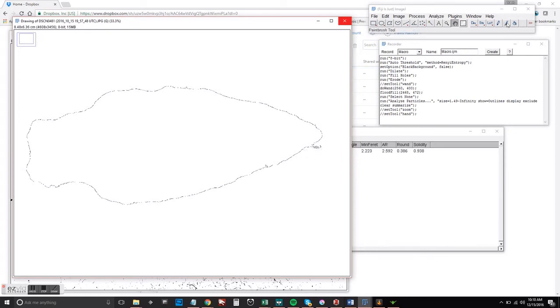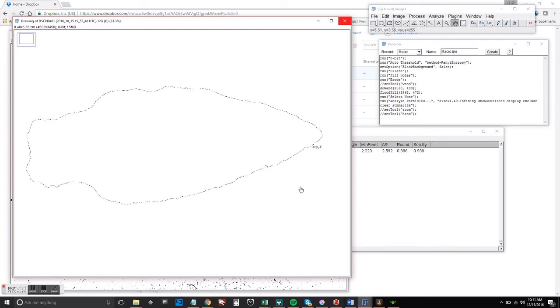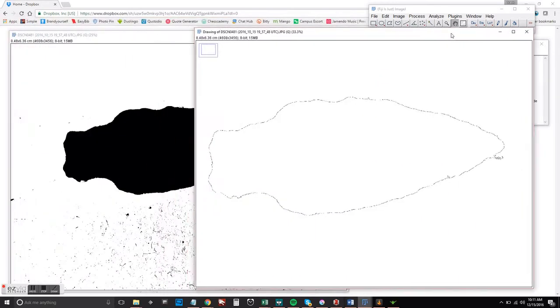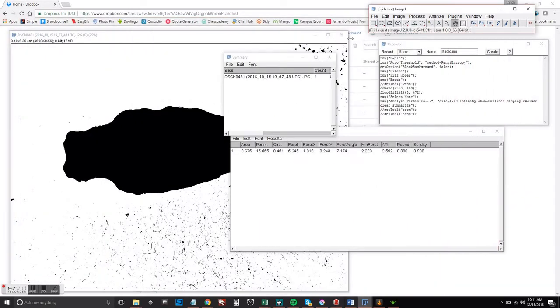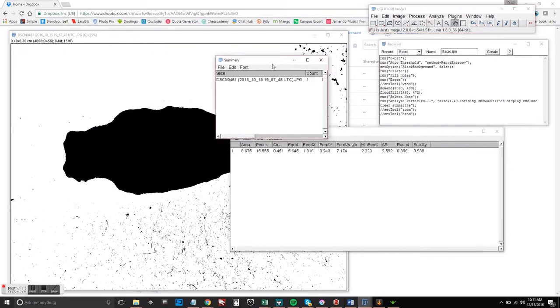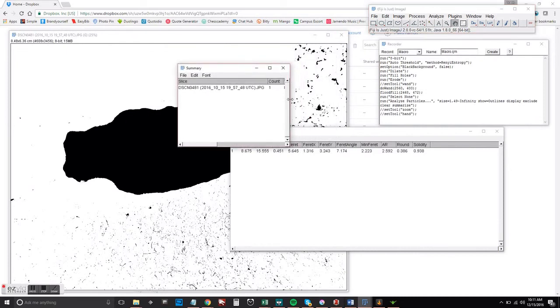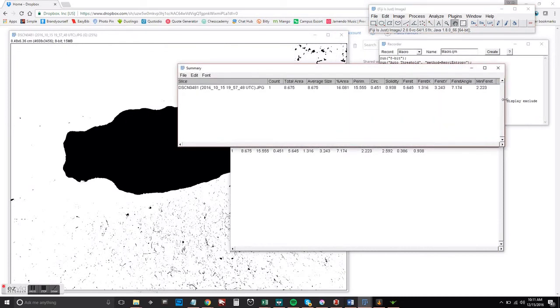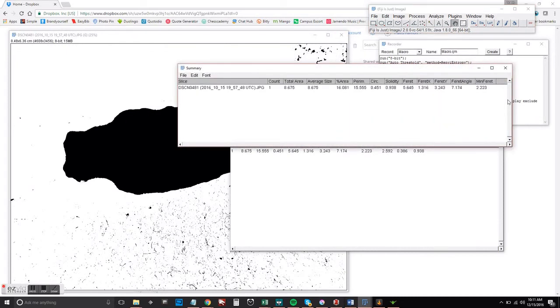But if you did want to get rid of that, you can go back and use the pen or the paint tool to remove that over here and then reprocess to get rid of it.